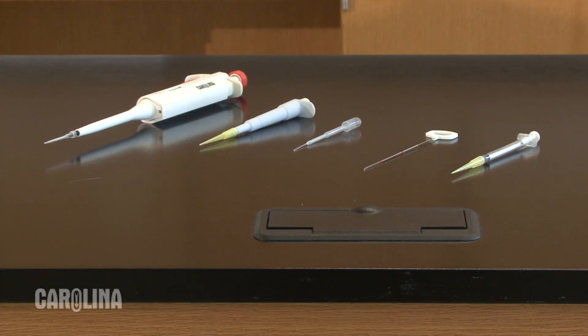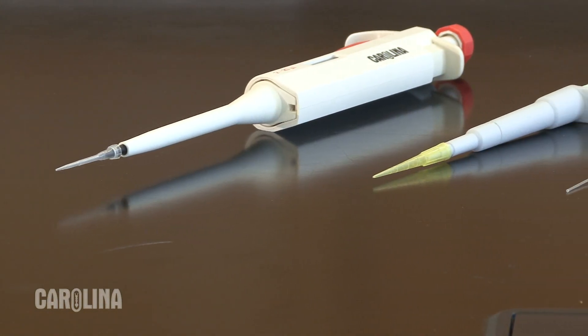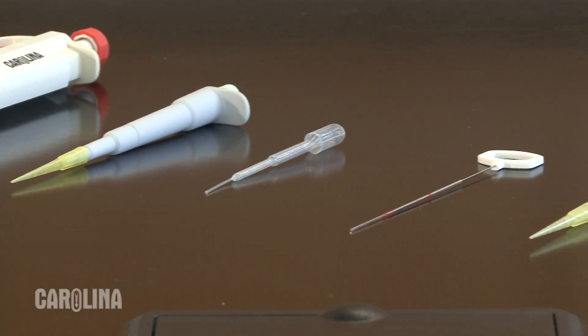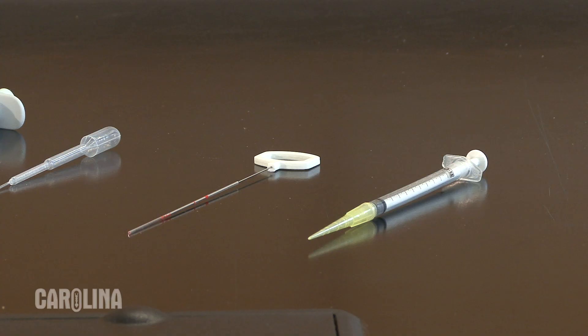How well you load the gel affects the quality of your final results. There are five devices available from Carolina for loading gels: an adjustable pipette, a fixed volume pipette, a needle nose disposable bulb pipette, a wire trawl, and a one milliliter syringe with rubber tubing on the tip. I will review the gel loading process with each of these devices.